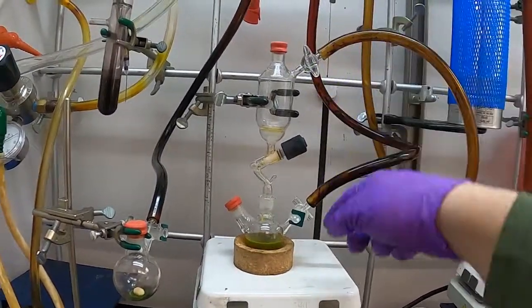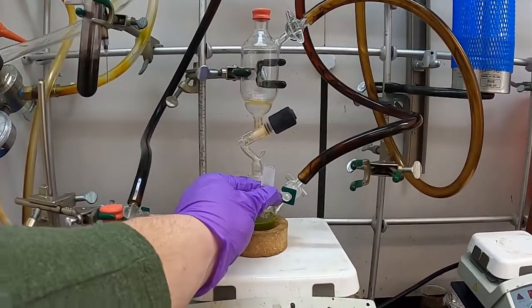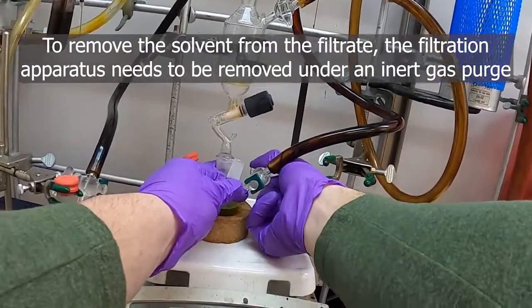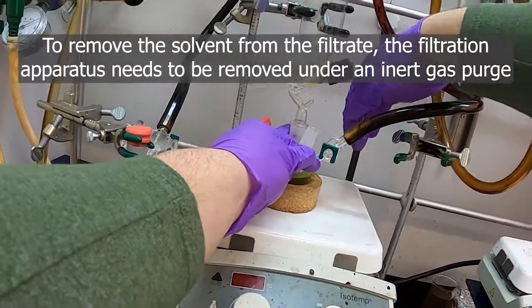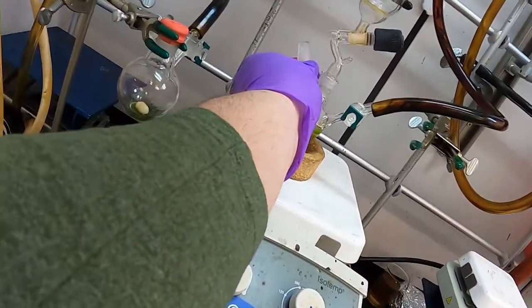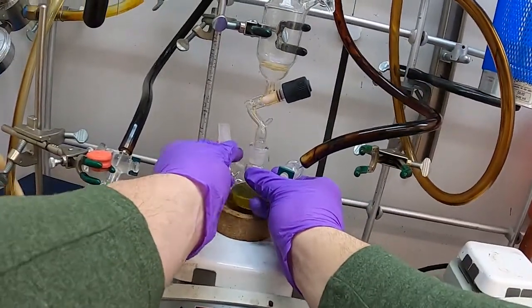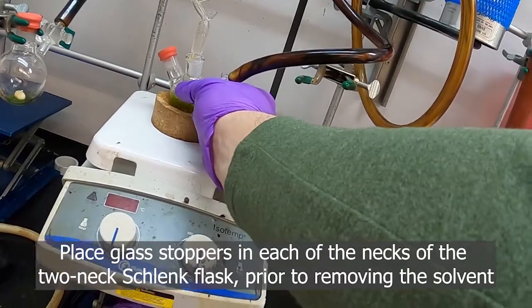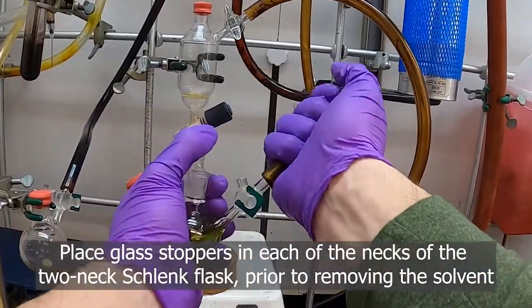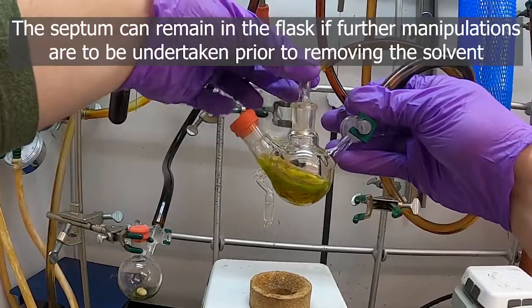An important thing, if we're trying to keep the solution under air-free conditions, is how to get this filter off. Much like any other system, you want this line to have been purged, then open to nitrogen. So you adjust the nitrogen flow — you can hear the gas hissing — and now we would have our solution filtered and under nitrogen.